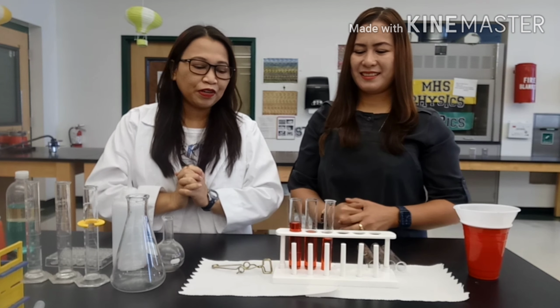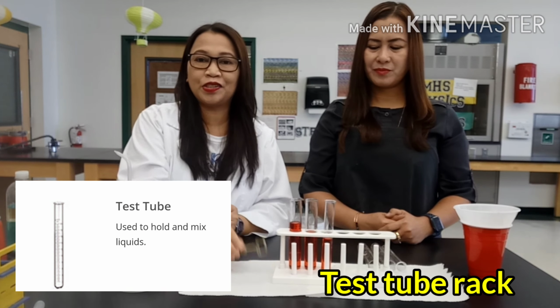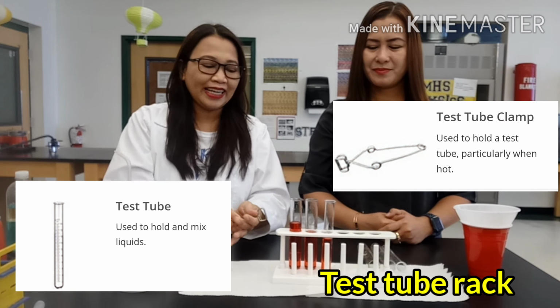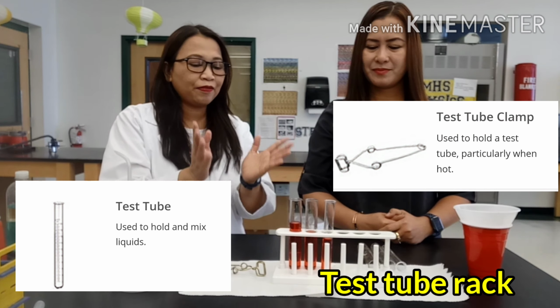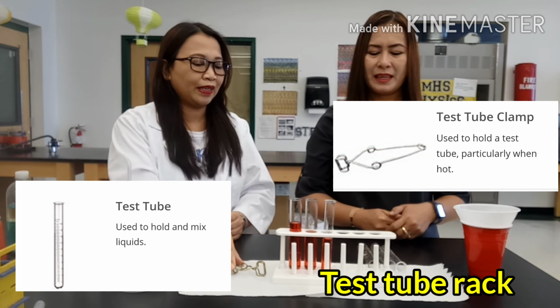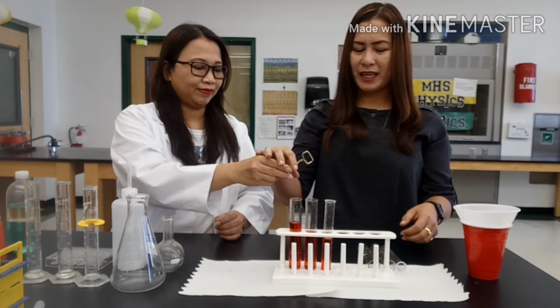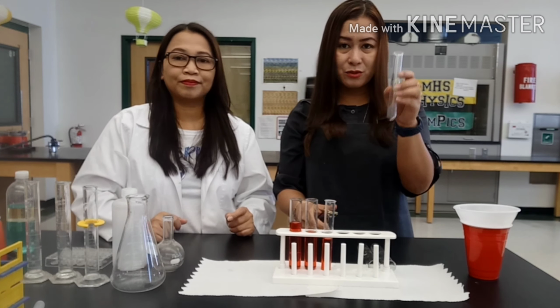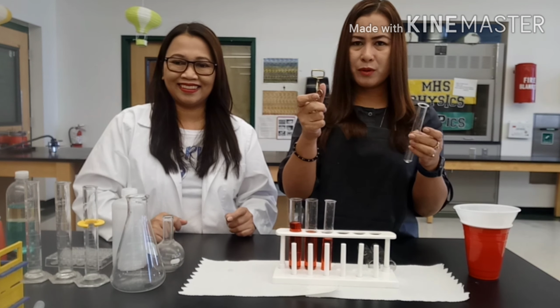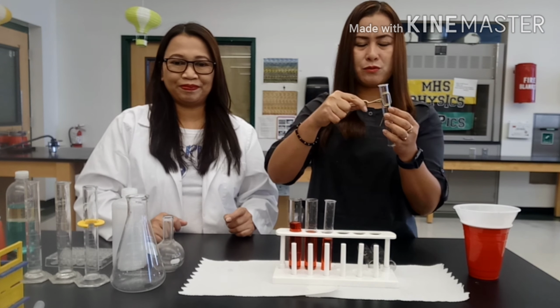All right, so this time we're going to have the test tube rack and the test tube holder. Let us see the different functions of these three apparatus. Miss G, can you show us how to use the test tube clamp? We have here the test tube and the test tube holder. We use the holder to hold the test tube.